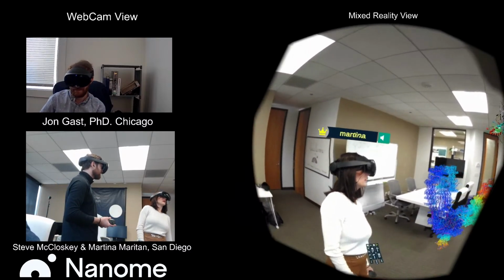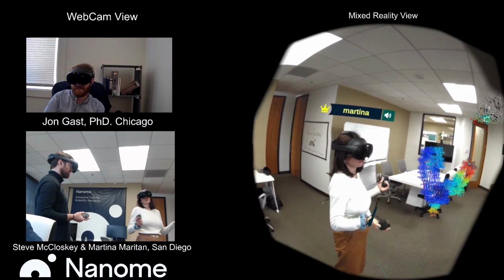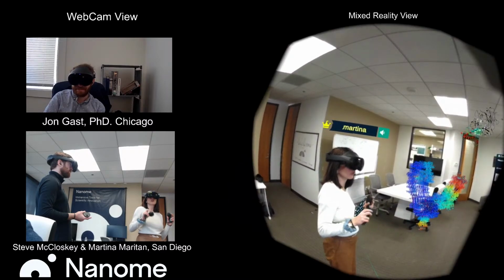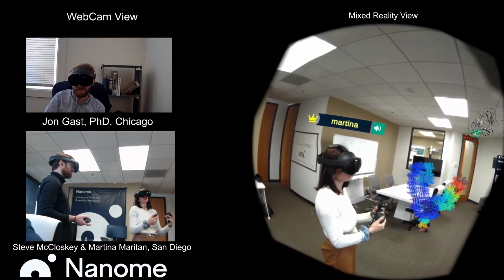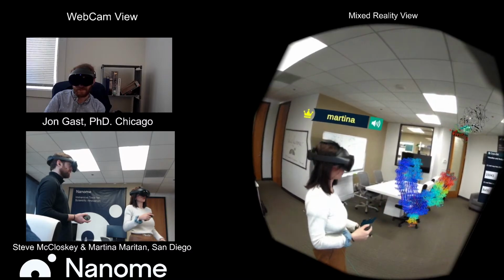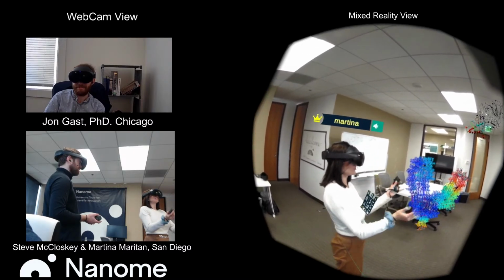Oh no, I just wanted to add that another way to look at maps versus atomic coordinates is that the electron density map and cryo-EM maps are sort of the ground truth, because this is what you saw and measured experimentally. And then what scientists do when they try to solve the structure is fit models inside these densities.